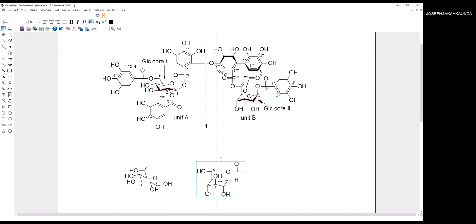Now, you need this proton to identify this value, this value, this value. But remember, this one and this are identical. It is symmetric. So when you have found this proton, you will get the value of carbon 1 prime, the chemical shift value of that. And you lead it to this, and this.